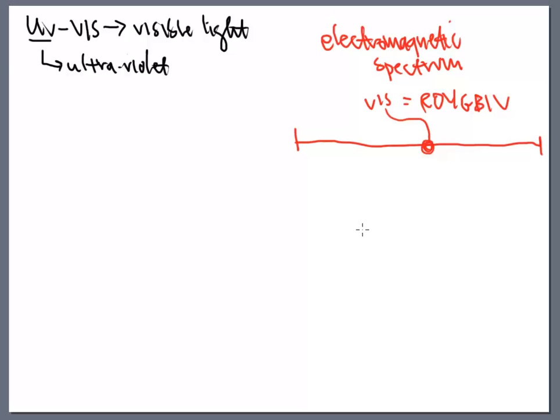Well, one of those is the UV portion. So this ultraviolet is part of the electromagnetic spectrum. So that means that's another piece on the spectrum. I can't see ultraviolet light with my eyeballs, but it's there, right? We know that it's there. If you go to a tanning bed, your skin will know that it's there if you lay in it too long, because those operate with a UV light bulb, very similar to what we're using here in this instrument. But these aren't the only two things that are there.